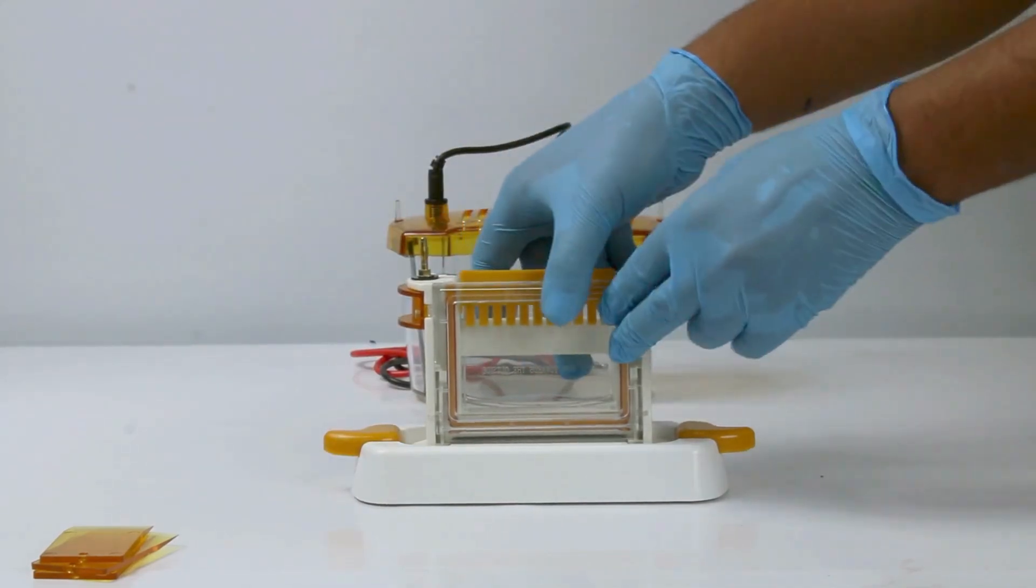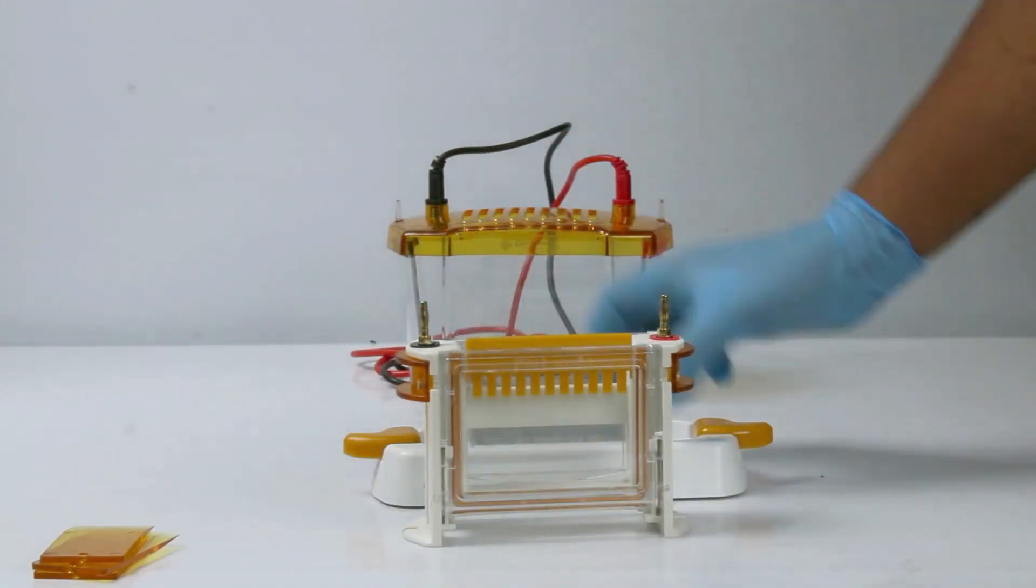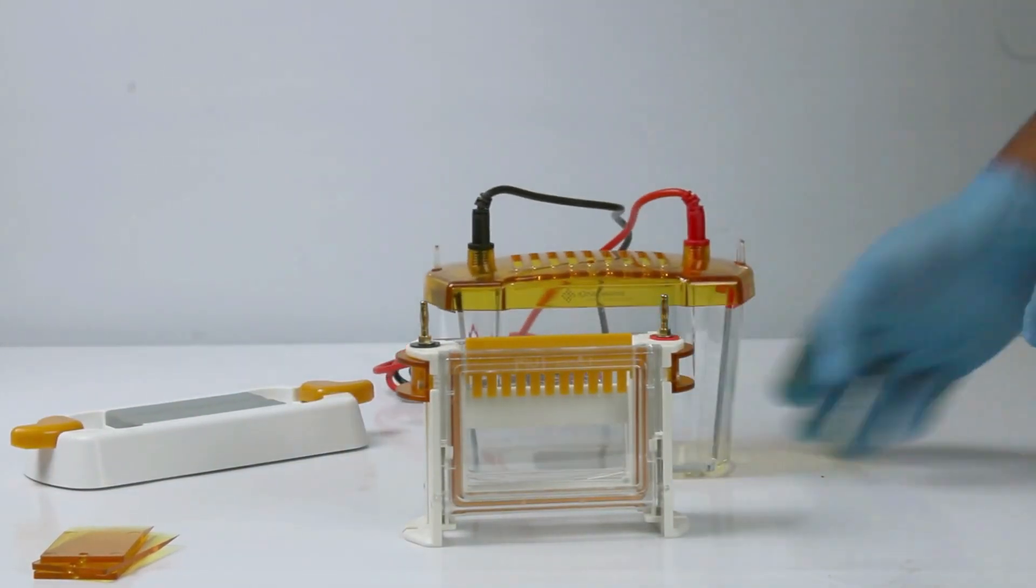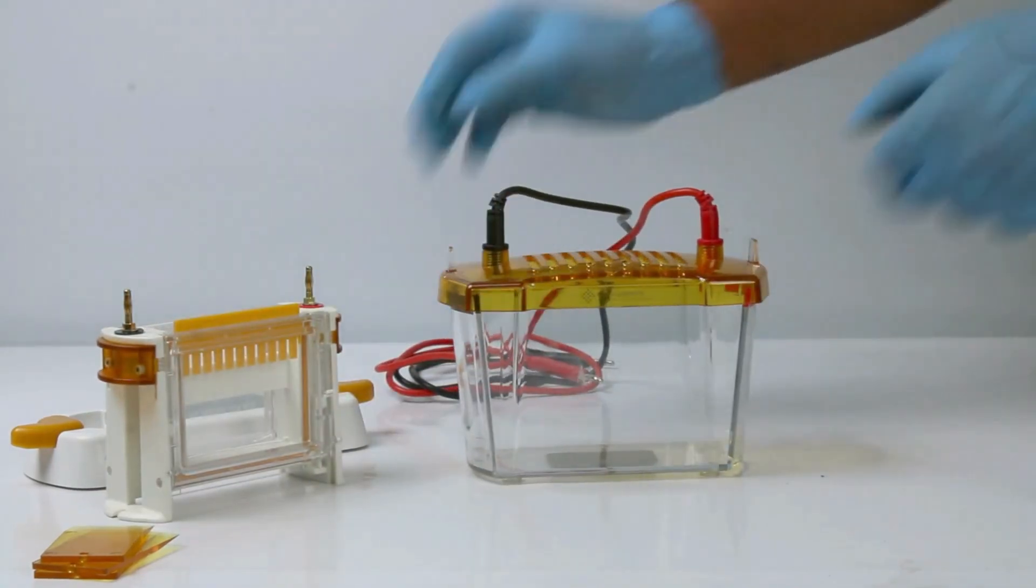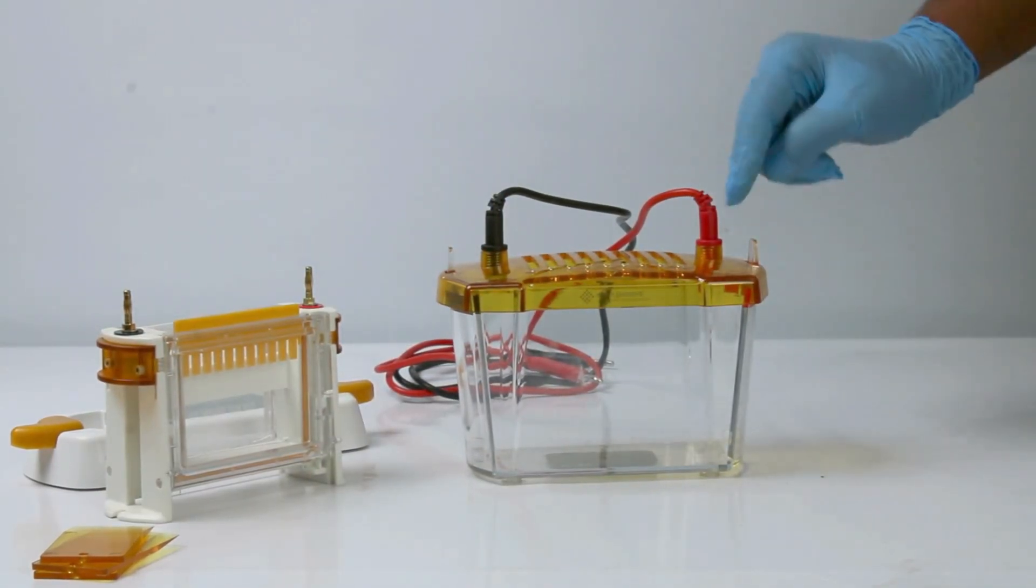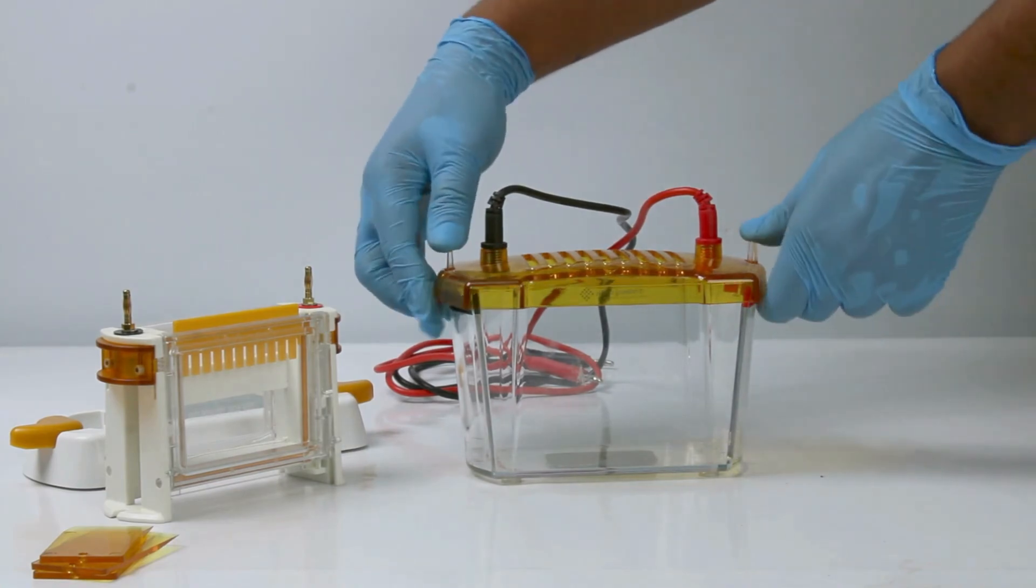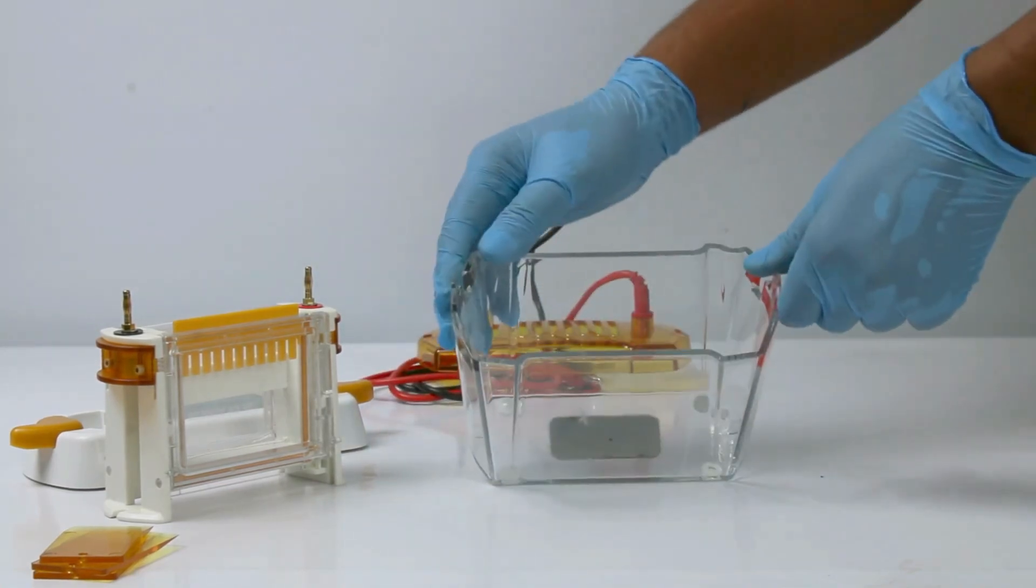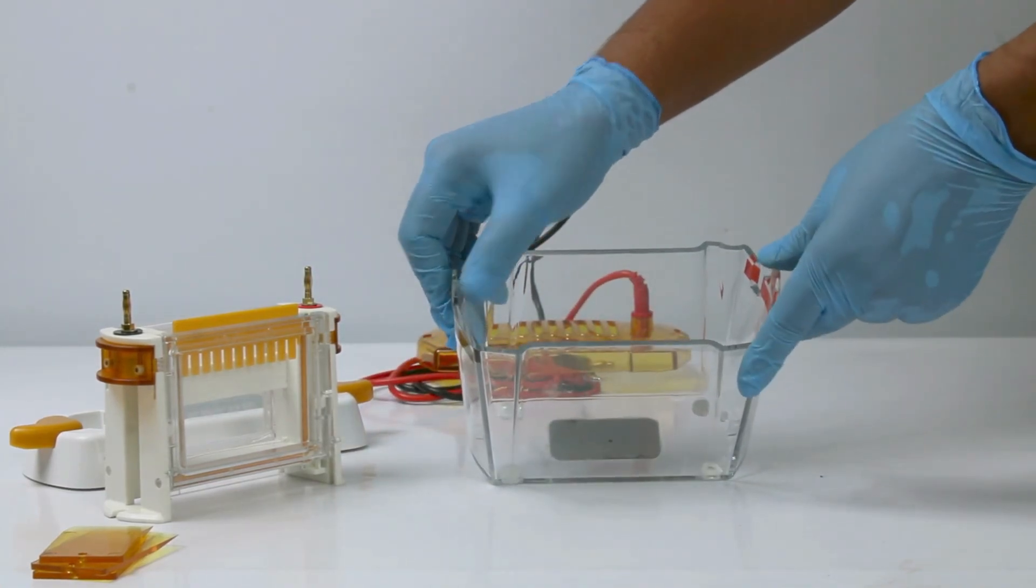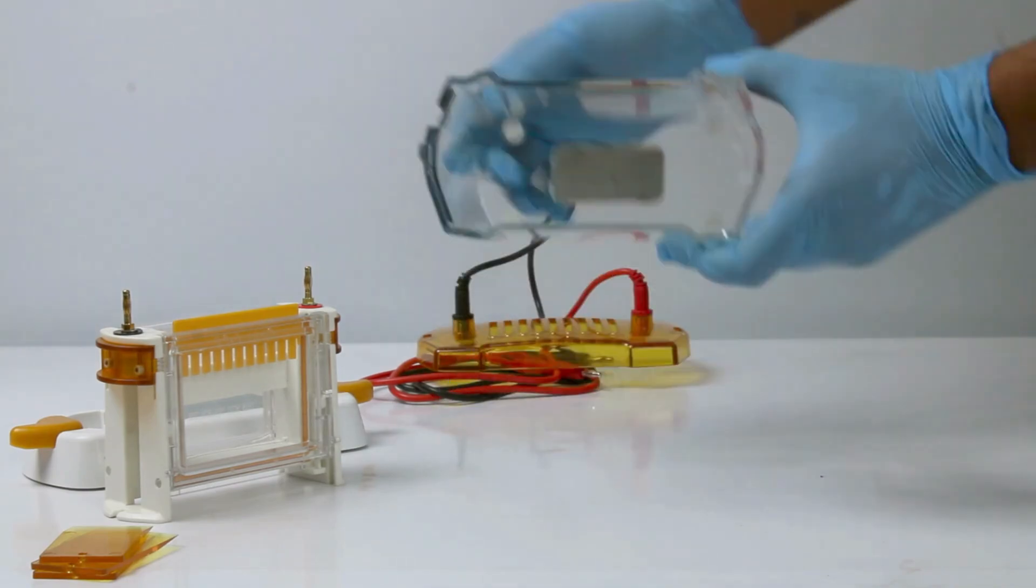Remove the electrophoresis bracket and place it in the electrophoresis tank. Now let us proceed with the electrophoresis procedure. Insert the electrophoresis bracket into the tank. Add the buffer to the main chamber of the electrophoresis bracket.